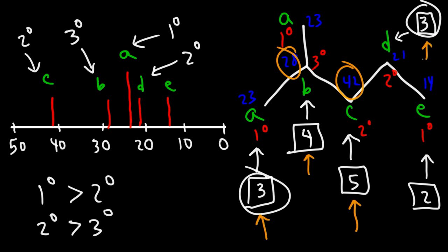These two have the same score, so their chemical shifts are very close. And finally, carbon E has the lowest score, so it has the lowest chemical shift. And that technique is very useful for ranking the different carbon atoms when dealing with alkanes in carbon-13 NMR spectroscopy.